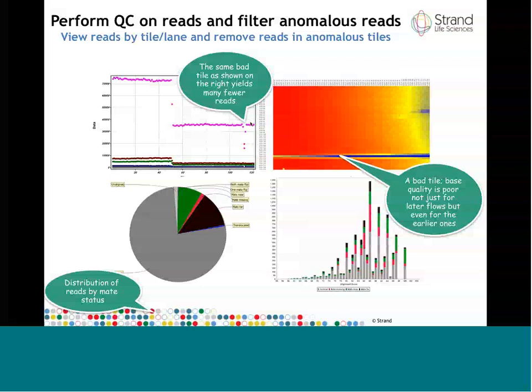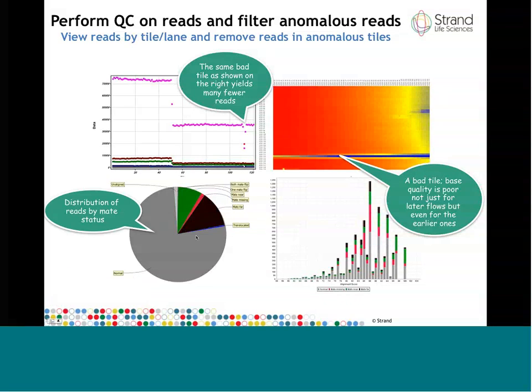Likewise, you can see views on, all of these are screenshots from the product. In fact, everything that you'll see in this presentation is exactly taken from a screenshot from the product, no external screenshots generated.